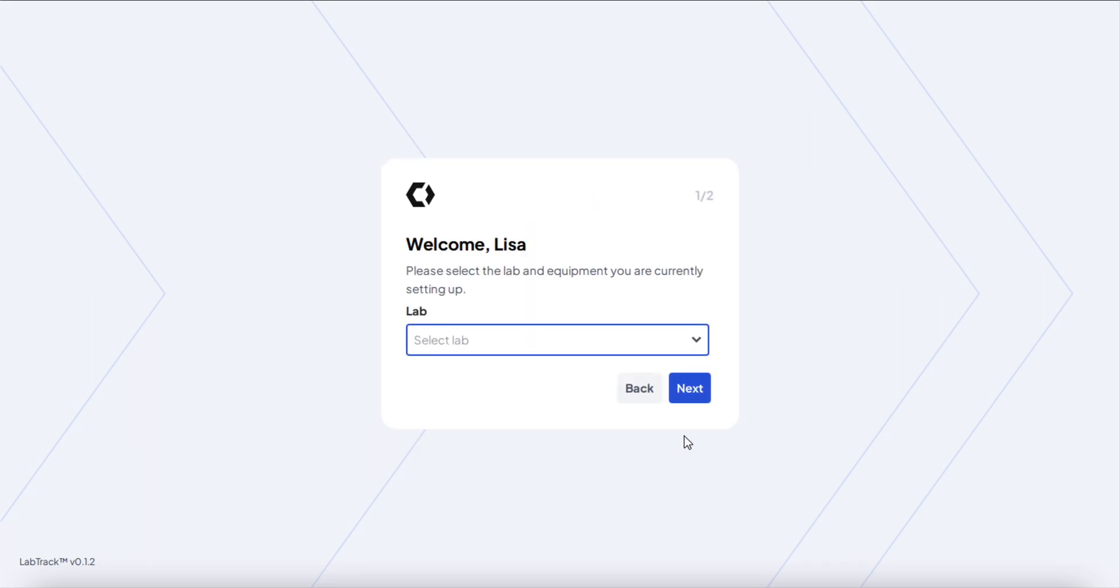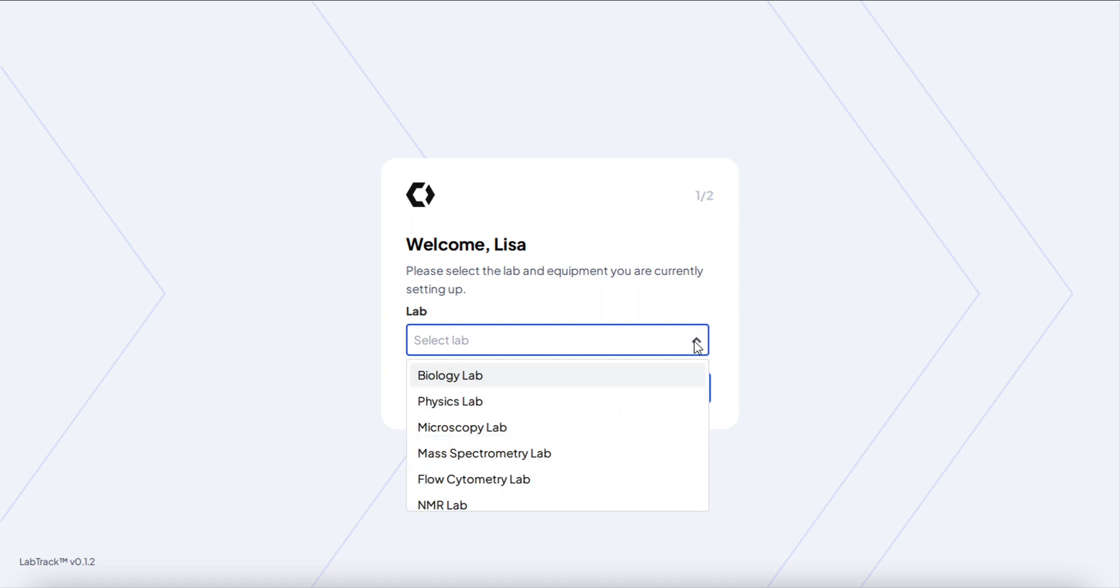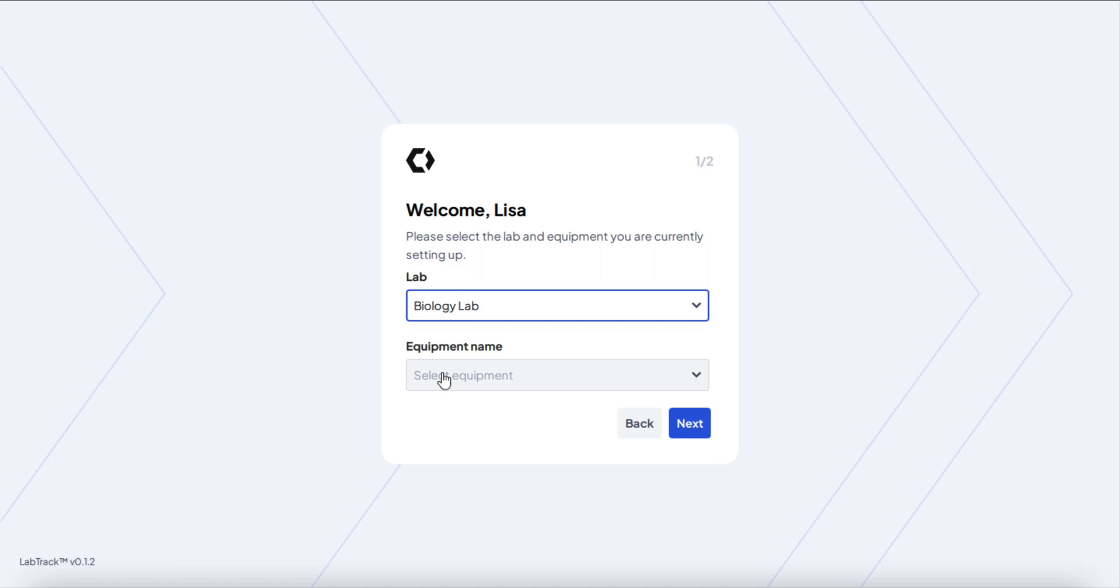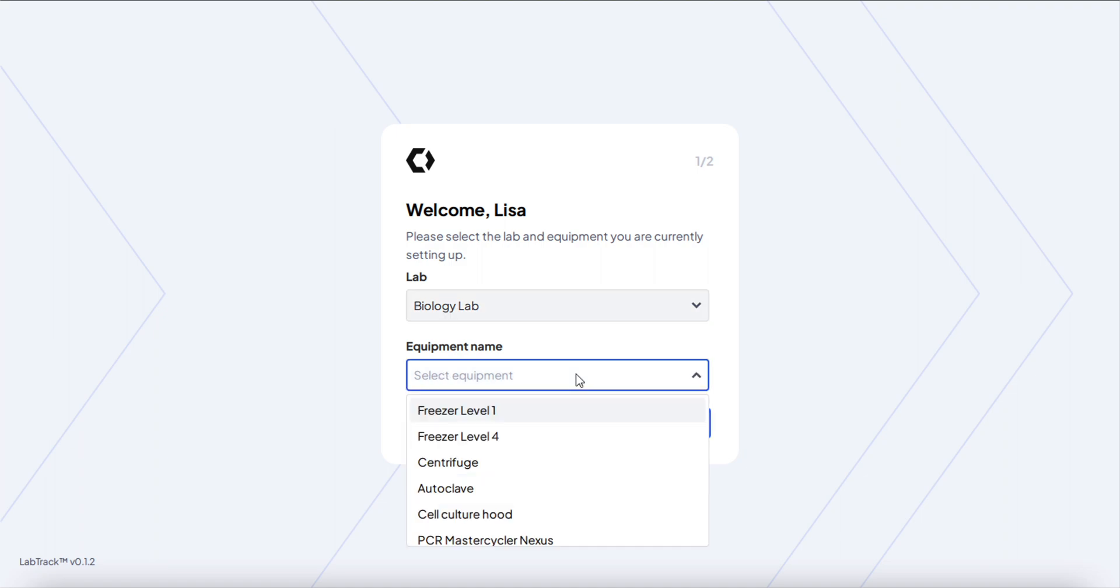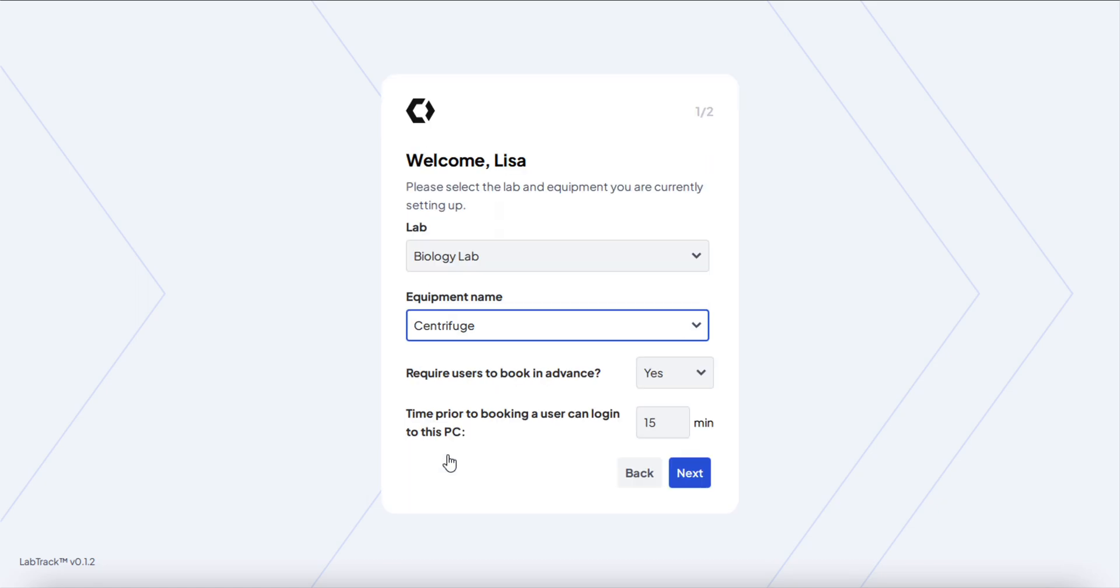You'll have a few steps. This first one asks you for the lab that you want to connect, so I'm going to go ahead with our Biology Lab. Next up is the equipment name, so this is where you select the equipment that is currently connected to the PC where you're installing the desktop app. I'm going to go with the centrifuge.